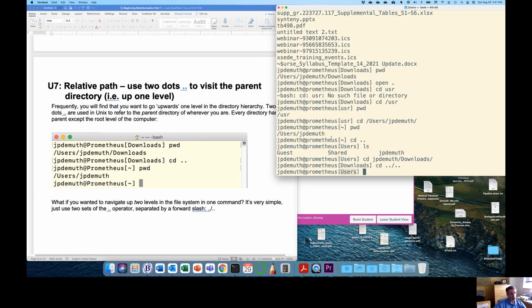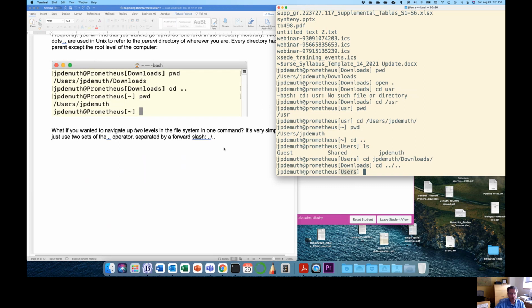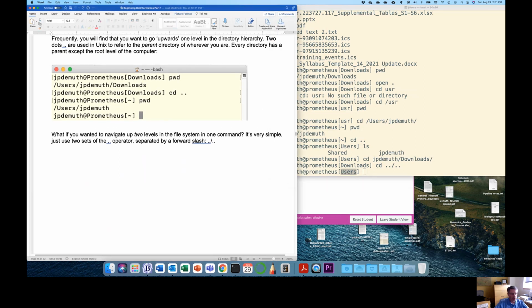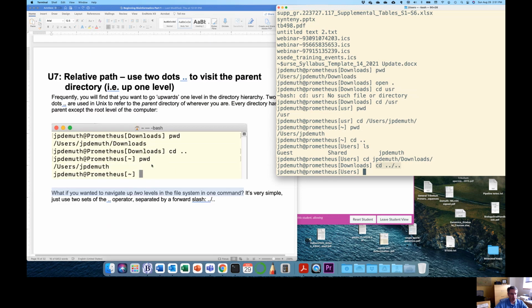And as you're going through these, it's always good, and especially if you get tired of listening to me and decide to just go through the Word document, it's always useful to ask yourself these little questions about what am I doing? You should be able to interpret what you're typing, not just copy what's on the document. Okay.